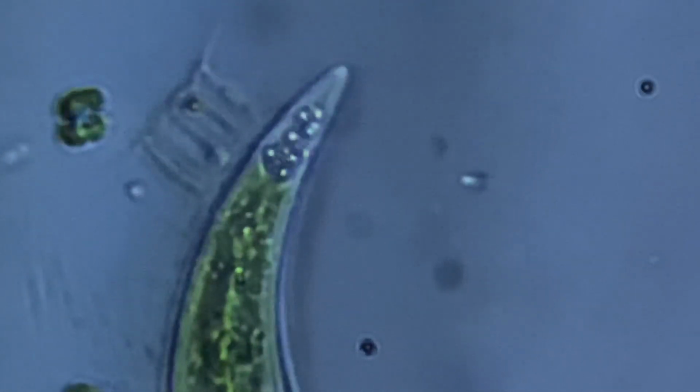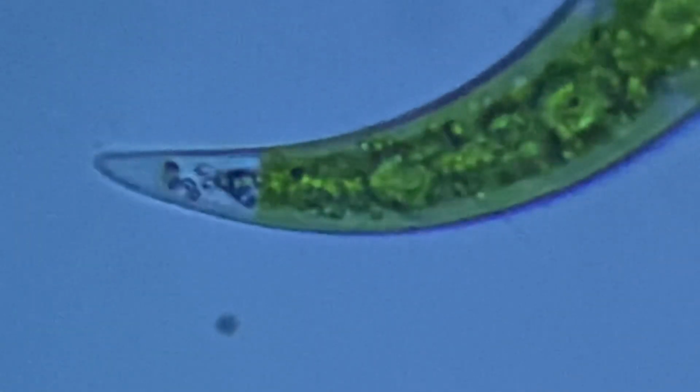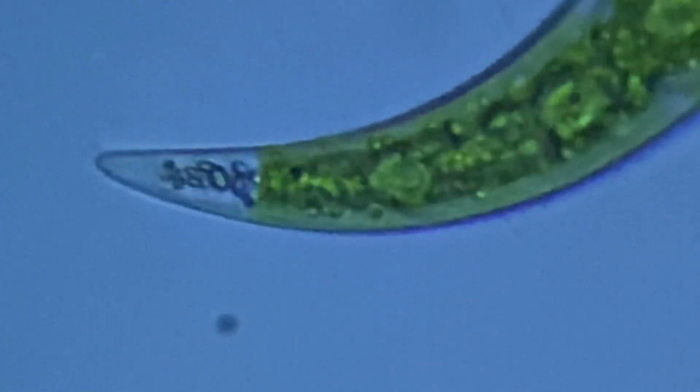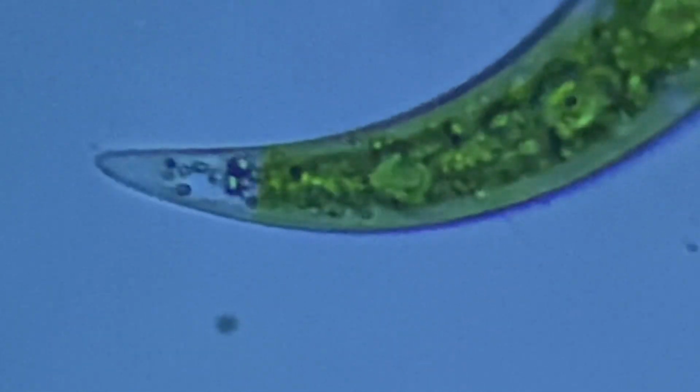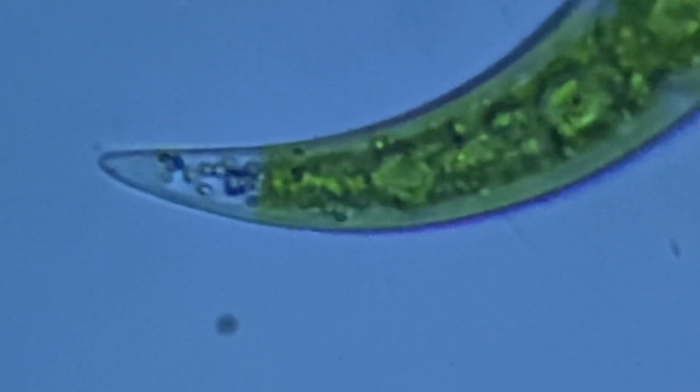This is called Brownian motion, which is caused by water molecules bumping up against the crystals. Scientists still don't know the function of these crystals. They actually don't need to have a function or purpose. Sometimes things are just there.